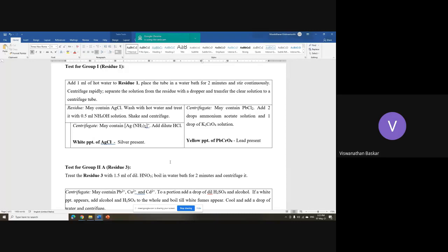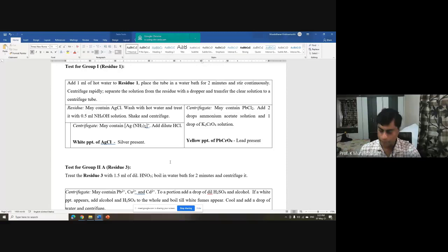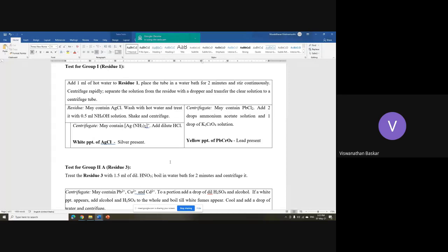It is better you analyze anions separately and cations separately. First, you would not know what you are given, so how would you add lead there? What you are essentially going to do is try and identify what is given to you. And this whole metal separation analysis that Murali said would help you in identifying which class of metal ions is given to you, based on its solubility in different reagents.